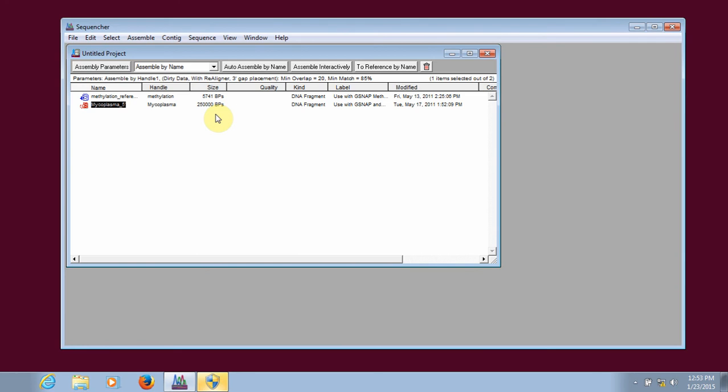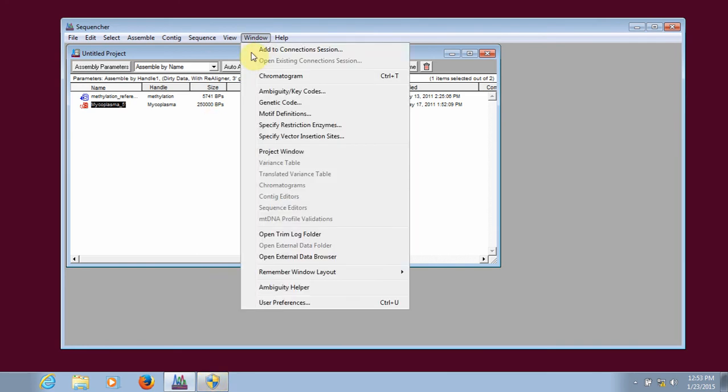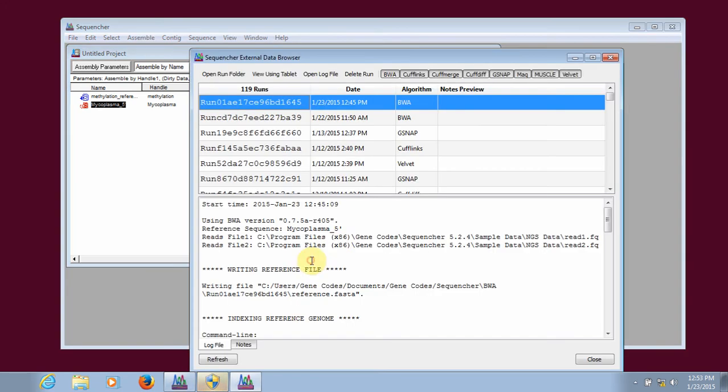Before we run our alignment, I'm going to go to Window, Open External Data Browser, to open the external data browser. This will allow us to track the progress of our alignment as we go.